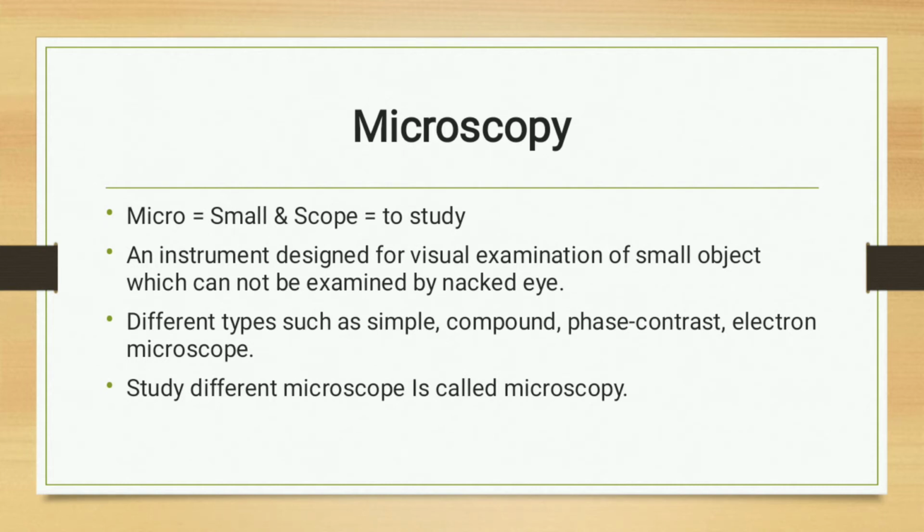So the study of different microscopes is called microscopy.